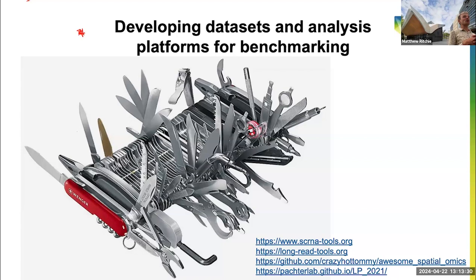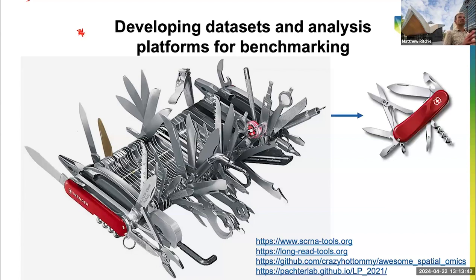So the goal of methods benchmarking and creating reference data sets is to try and simplify life, from having a fairly complicated all-in-one pocket tool to something that's a bit more refined. Okay, for this sort of data, we use this followed by this, and we don't have to try and explore all of the different options available to us, which of course grows and grows over time.